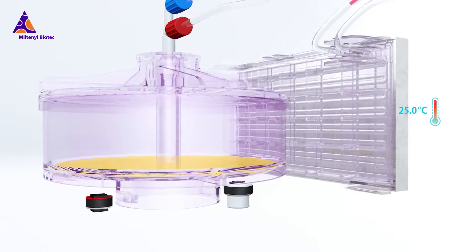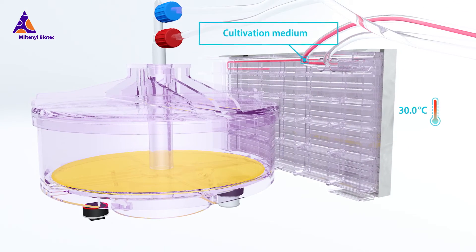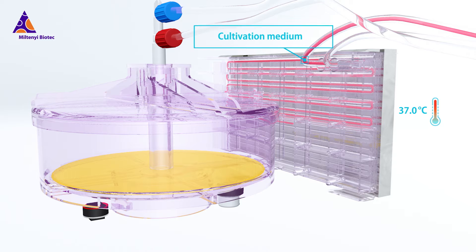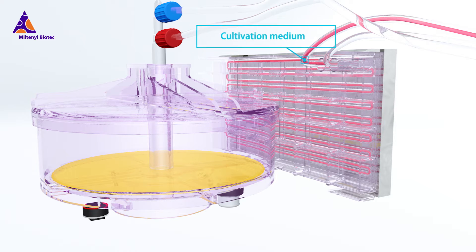The integrated infrared sensor and the temperature control unit ensure that the sample is kept at ideal culture conditions during the entire process.